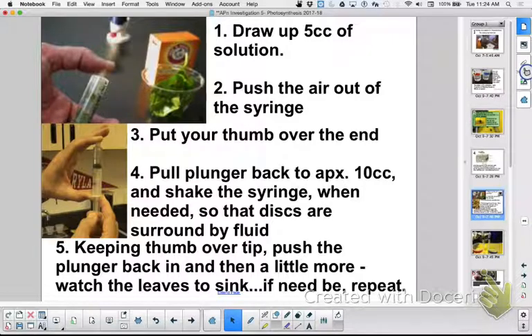And so, again, when I look at this, it would look like maybe they wouldn't go down, but if you give them a tap, tap, and just let them sit, now lesser sinking. Yeah, give them just a tap, tap, and let them sit. They should hopefully then sink, which they are doing. Did you see that they're doing that?